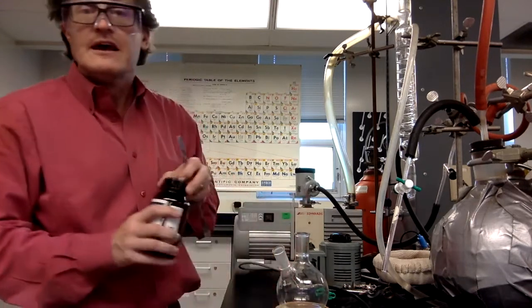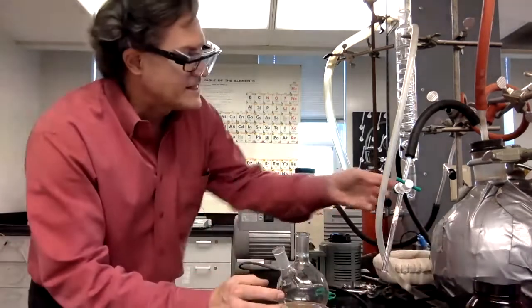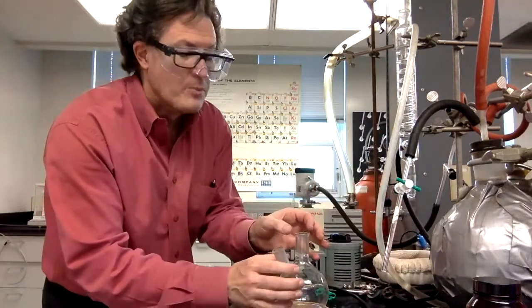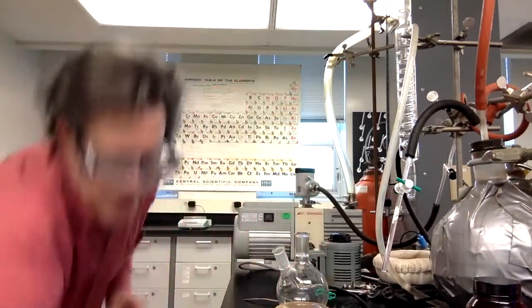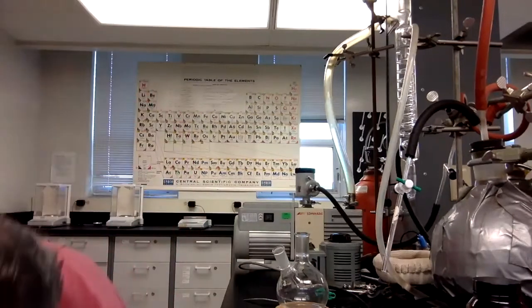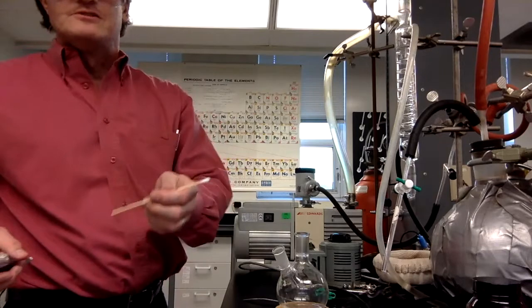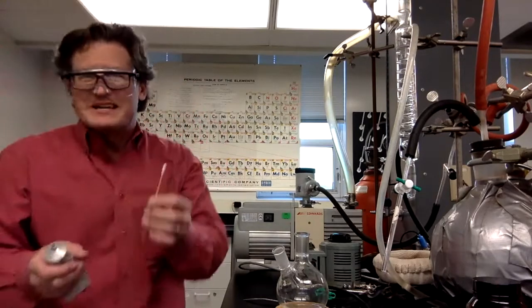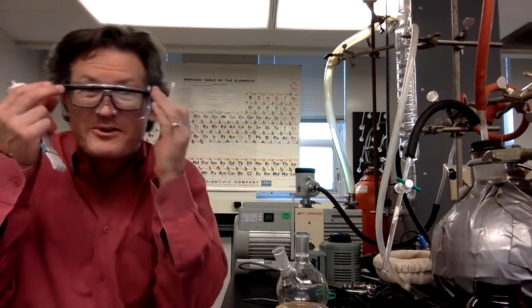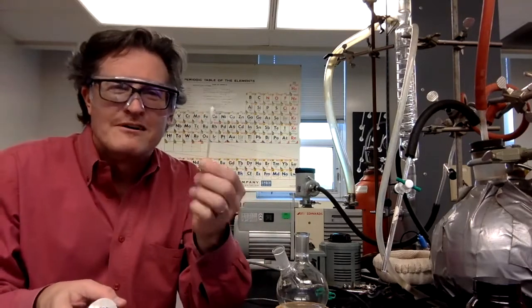Why not? There is vacuum grease on there, right? We need to make that seal up here. We put a very thin layer. And when I say a thin layer, I mean we get our tube of vacuum grease, take a little applicator stick, i.e. a big Q-tip, like one of those swabs that they need to jam up your nose for a coronavirus test. Yeah, one of those guys. We got them all over the place, right? Okay, so, hot item right now.